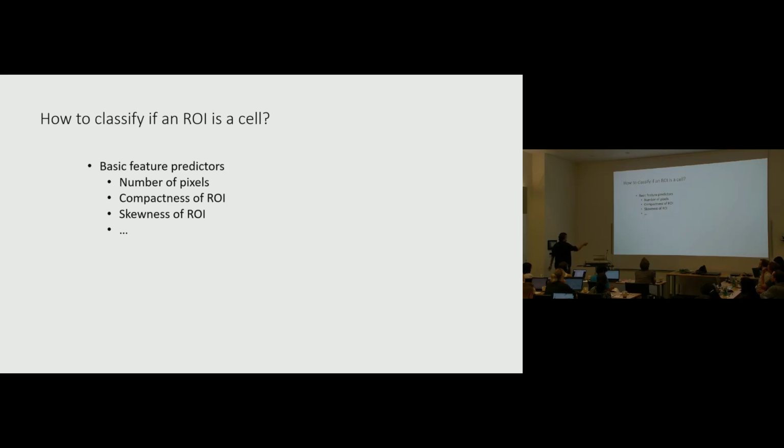Okay, right, so these are some of the features that we use already, and actually we've been thinking for a while of adding some kind of more descriptive features about the shapes of the masks. So I think we're going to try that in this workshop.